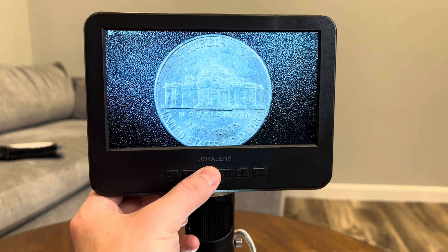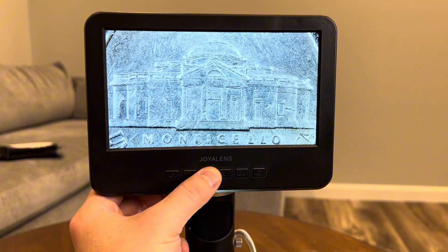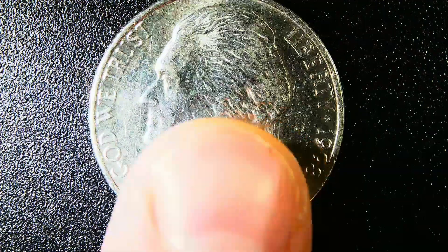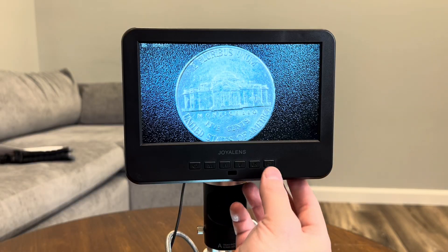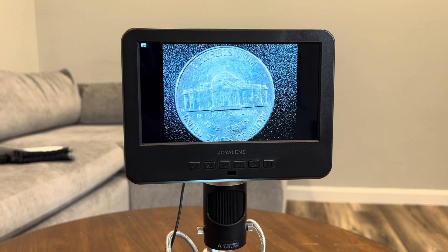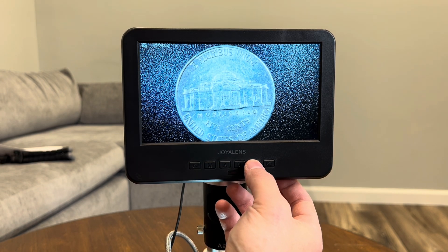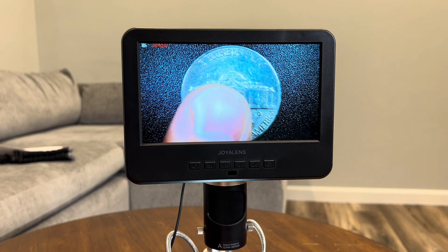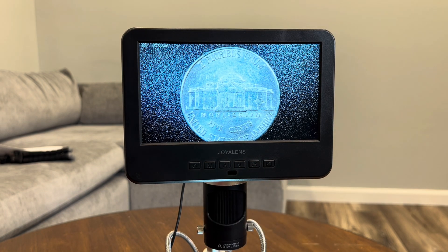For a more everyday use, let's take a look at a coin. This demonstrates how well the microscope handles reflective surfaces and metallic textures, which is great for coin collectors or anyone analyzing small objects. Even at lower magnifications, you can see the overall texture of the coin, and the lighting adjustment helps reduce glare from the metal surface. Capturing an image is as simple as pressing the capture button on the display, and you can record video by pressing the start recording button. This is super handy for documenting a moving process. Once done, you can easily transfer your photos or videos to your computer via the SD card.